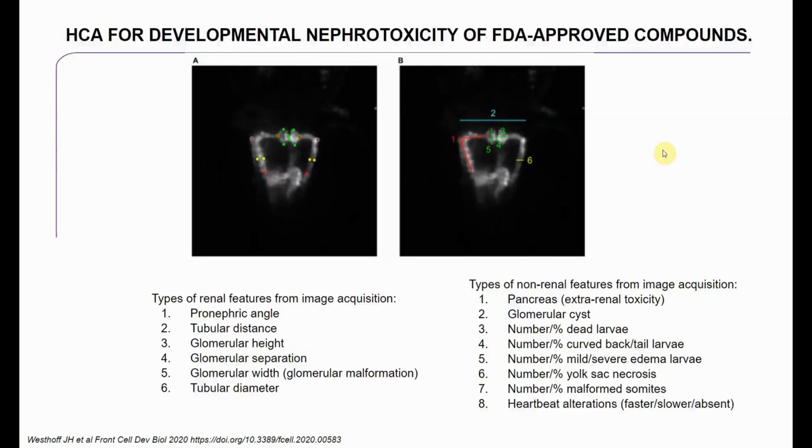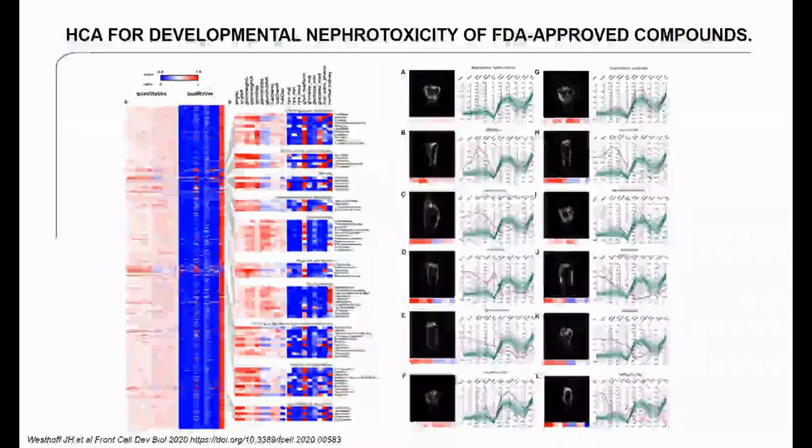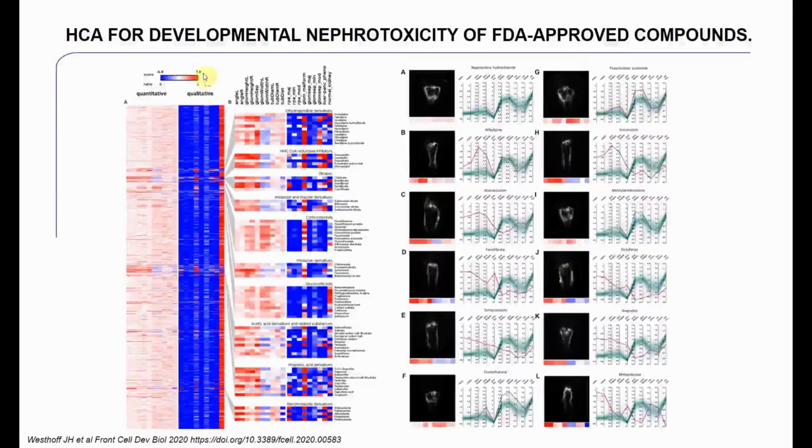Another method was to build a system where an expert could quickly look at each of the kidneys and score them according to various metrics. So what they did then is they took these different methods and they compared them.